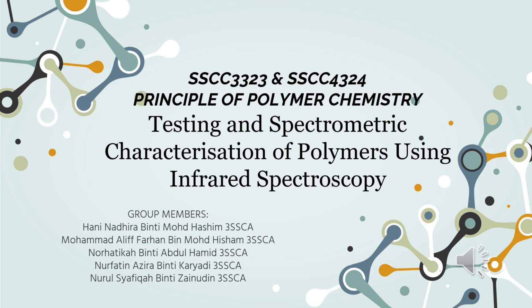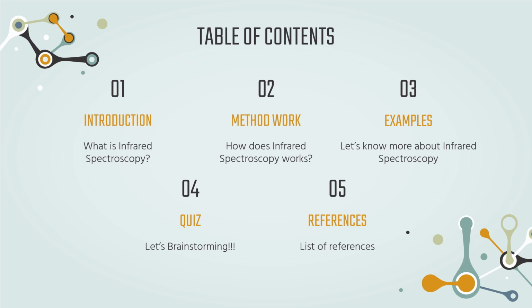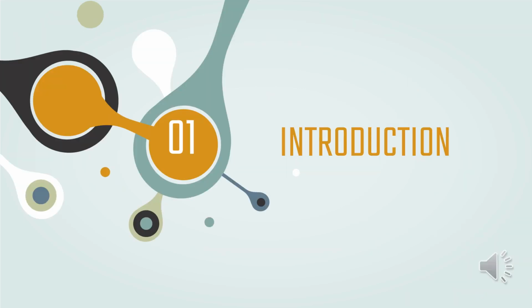We present about testing and spectrometric characterization of polymers using infrared spectroscopy. Firstly, I will explain about method characterization using IR spectroscopy.